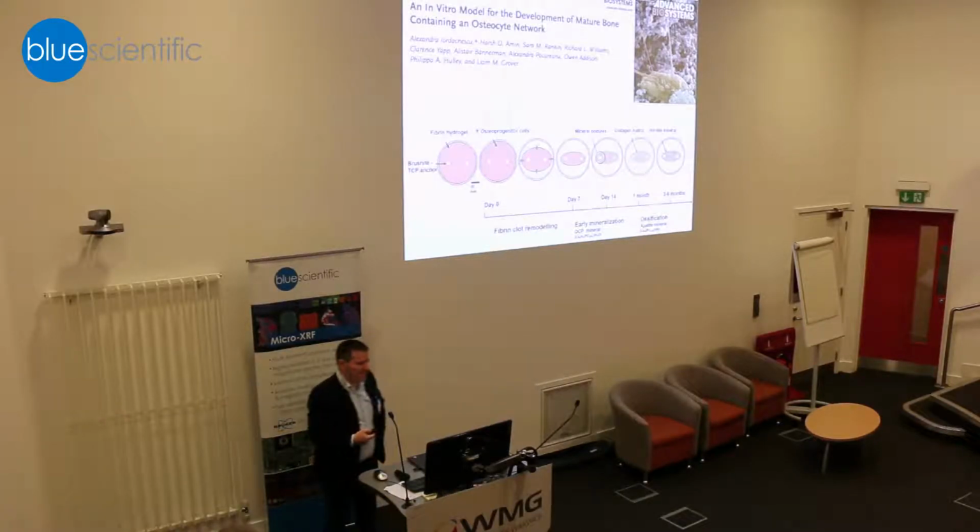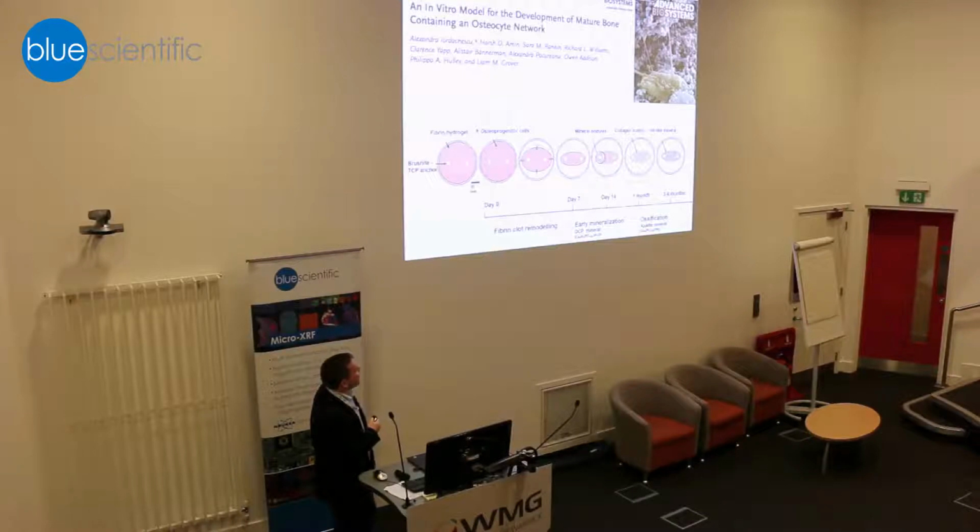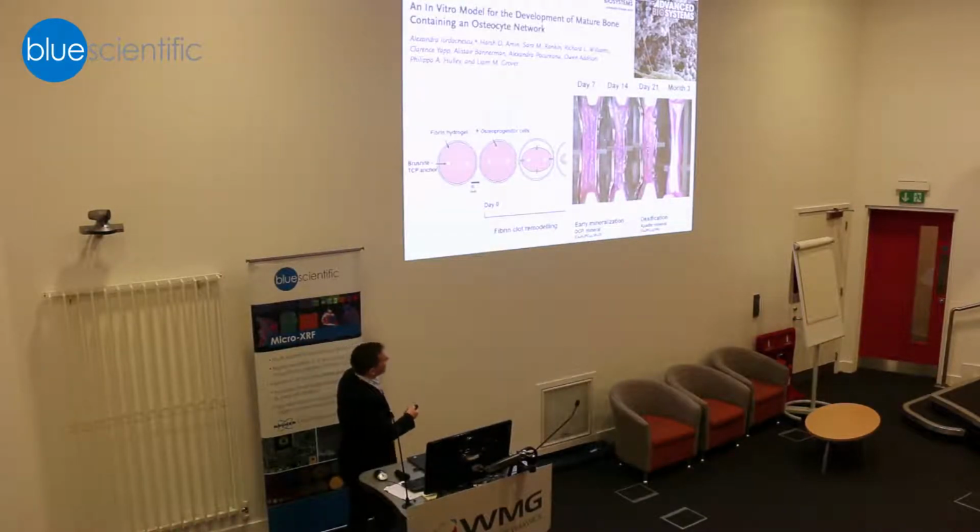And over that time, because you're providing that 3D matrix that's roughly similar to what happens in the body, those precursor cells start to differentiate, and they lay down bone, and they start to construct the same or similar 3D microenvironment of bone that you'd normally see in the body. And what we'd expect to see is for that whole structure to be replaced by bone mineral over time. And indeed, that's what you can see here.